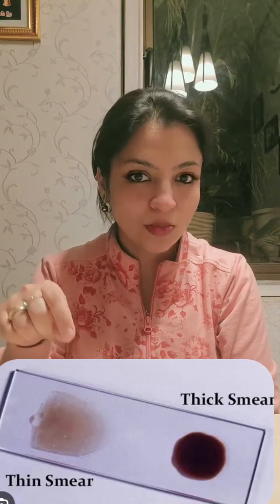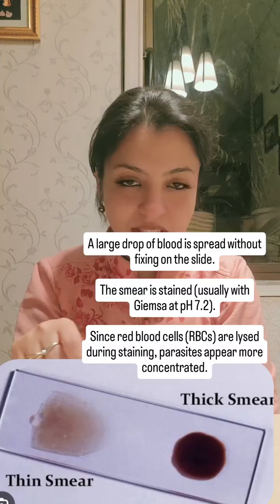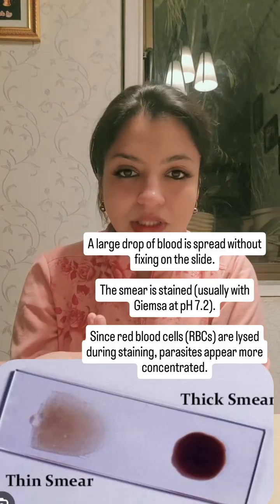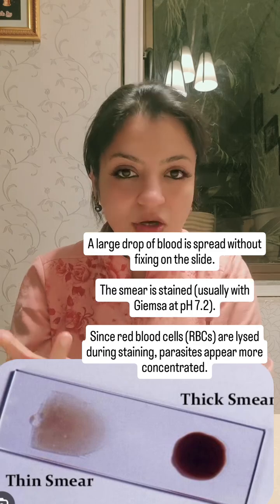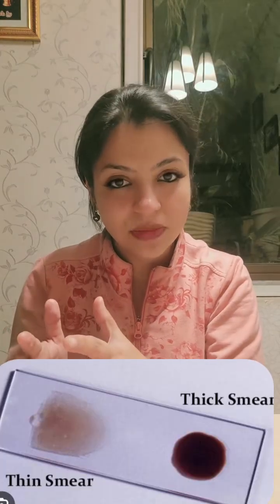we do is we keep one drop of blood and we do not fix it. Okay, so we do not fix it in methanol. We directly stain it with Giemsa stain at the pH of 7.2. So when you're doing this, what are you doing? You're basically lysing all the RBCs. So when your RBCs get lysed, obviously what you are seeing is just the malarial parasite. So you are able to identify the malarial parasite easily.